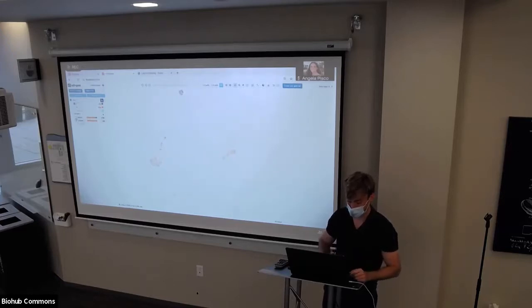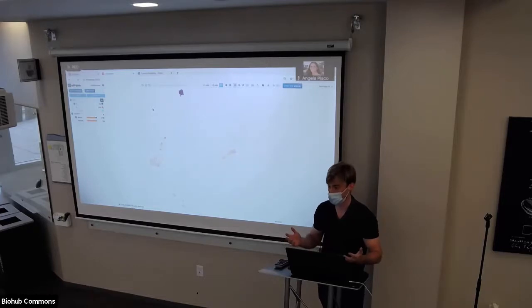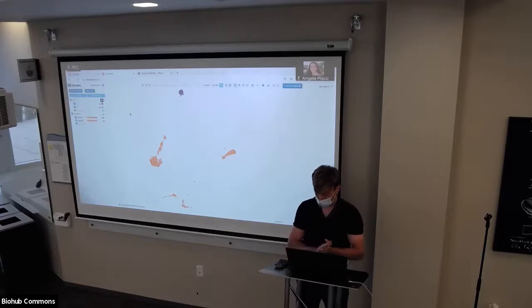If I turn on PBMC500, which are these cells at the bottom here, and you can tell by hovering over this label, it highlights them in the scatter plot. You can see, oh darn, I'm still not selecting the top cells because the intersection is still 0. If I select the top cell, all of a sudden these guys get selected. This is just to illustrate what it means to cross filter. It can help you filter out cells in really complex combinatorial ways. You can filter based on the expression of certain genes and its location in a particular part of your scatter plot, or its assignment of being a particular cell type. So that's cross filtering. And to remove the selection state, you see how there's the dash here? You just have to click that, and then everything is now selected. So that's another way of selecting.